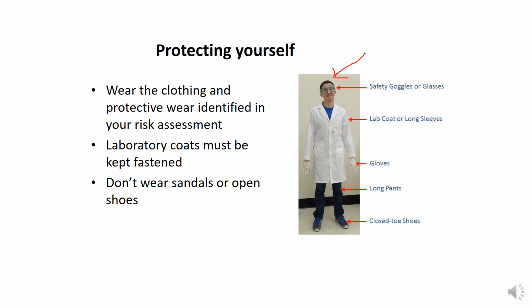And of course the lab coat is compulsory every time. Of course gloves are important while you are working in the lab. And it is really very important to cover your whole body, with long pants or whatever dress you are using, so it should be long, not any naked part of your body, to avoid any chemical injury or any spillage of chemical on your body, which can hurt.